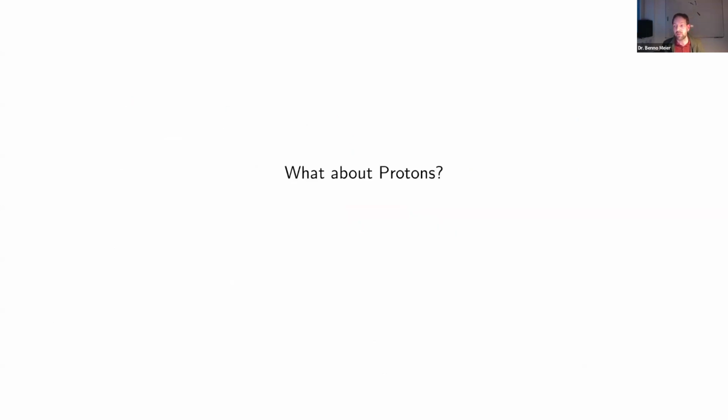So we have the same question again. What about protons? What can we do? Okay, and now this is where automation, I think, has made a difference for us. The story, in my view, is essentially this. So, of course, we've been trying to do proton hyperpolarization for quite some time, but we were not quite able to systematically study the effects that would give us a strong proton hyperpolarization. And that's due to variability in the system.